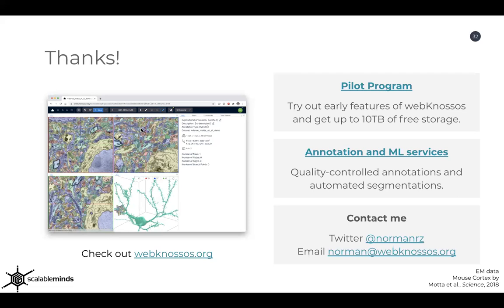So yeah, it helps in a bunch of stages, and of course once your data is all ready, then you can publish that data and share it with others. And some people even put links to their data set on webKnossos into their paper so that other people can browse it directly and explore the figures that you otherwise will only have in static form on your paper.